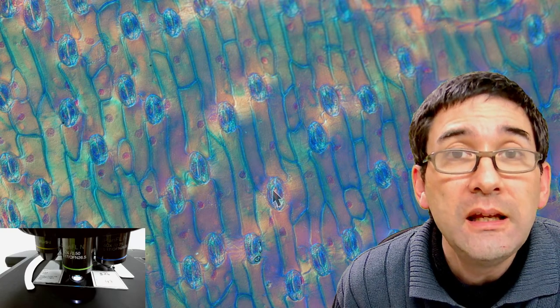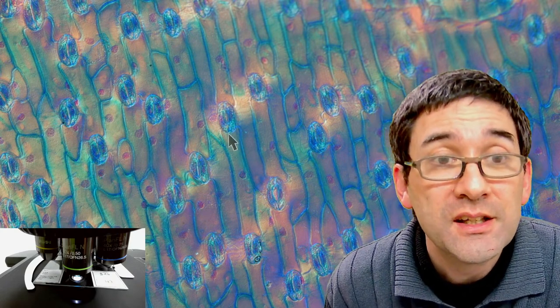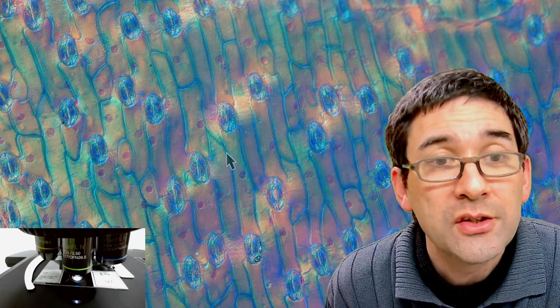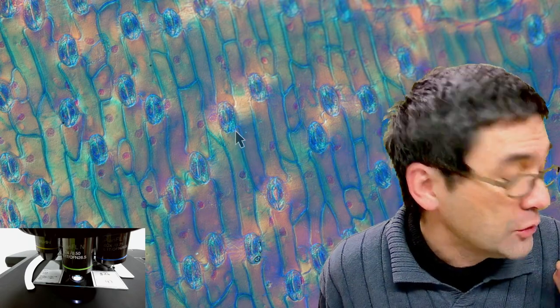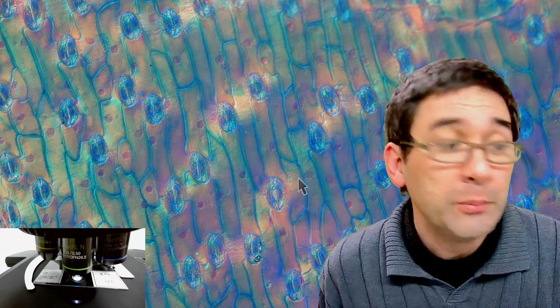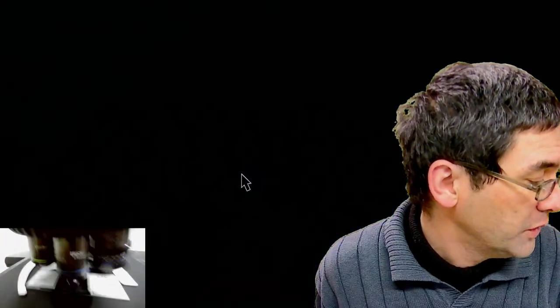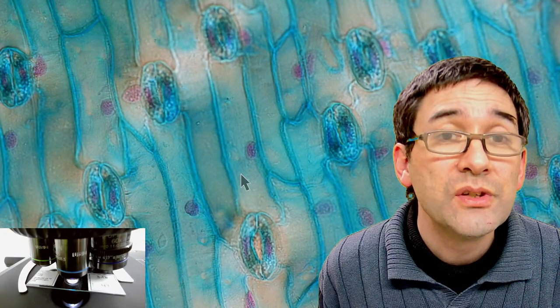Basically the opening into the leaf of the tulip allows gases like carbon dioxide to enter it for photosynthesis. The cells here each have a nucleus — you see this little dot over there. On the outside is the cell wall. What I was not able to see before with the glue method is the nuclei and so on, because I was only able to see the surface texture. But here when you have a very thin and properly stained view from the top, you're also able to see different cell organelles like the nucleus.